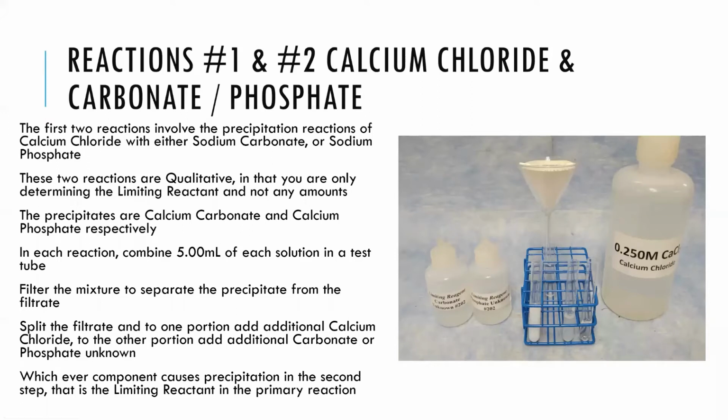In this first part of the experiment, you're looking at these precipitation reactions. And the first 2 reactions are purely qualitative. What is the limiting reactant? And that's really all you're getting at. What is the limiting reactant?